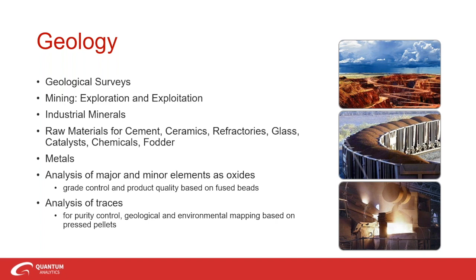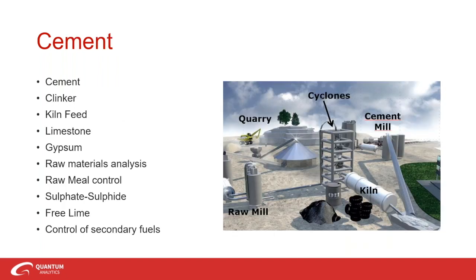Some of these examples include the analysis of samples at various stages during mineral processing for quality control and optimization of your recovery rates. XRF has important applications in detecting penalty and waste elements in iron ore that dilute the overall grade of the ore. They change the physical properties of iron and impede the proper operation of the smelting facility.